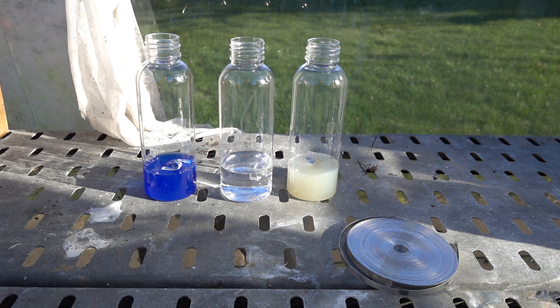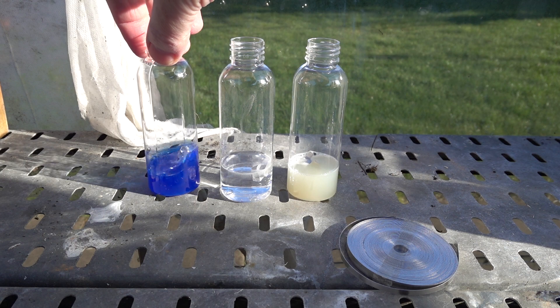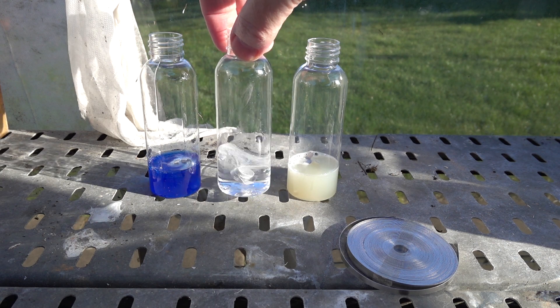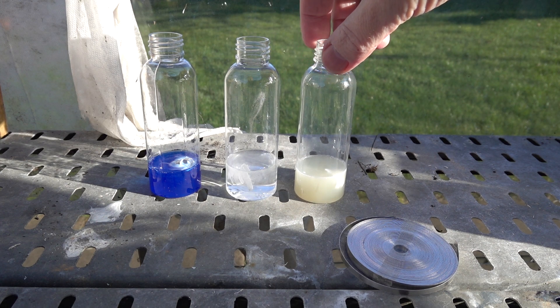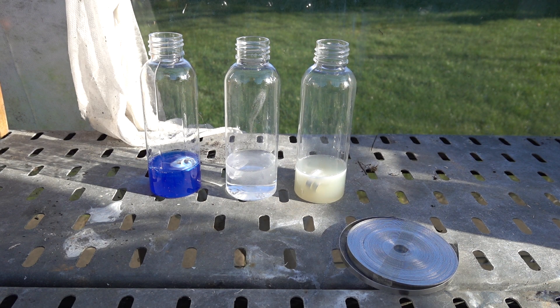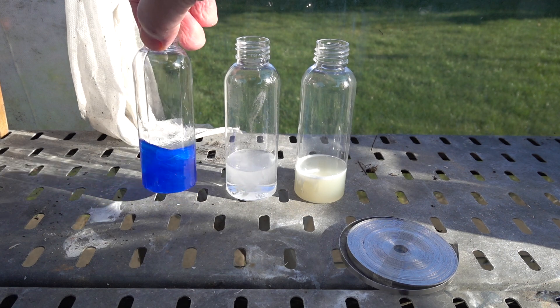In all three cases you should be able to see that the magnesium is floating. Let's just give them a little swirl — it's sunk in the ethanoic acid. Up it comes with the bubbles again. So we've got bubbles in all three cases, and the magnesium is reacting with all three acids.